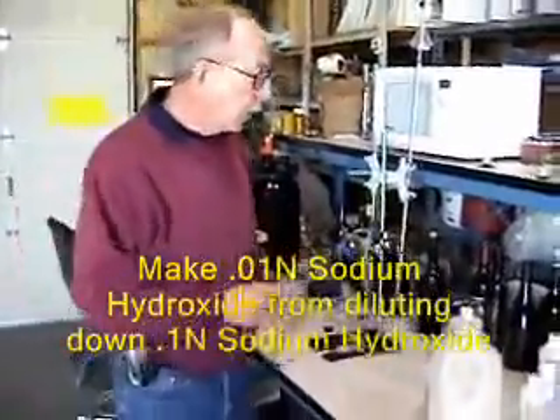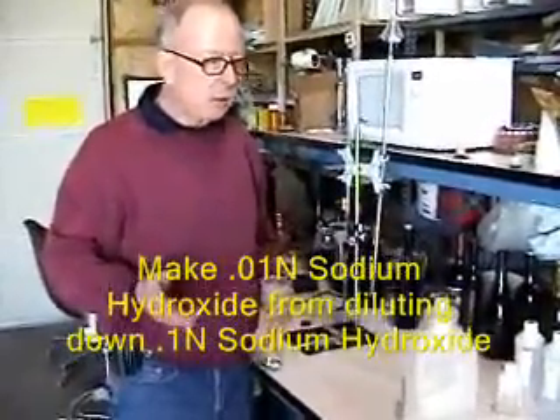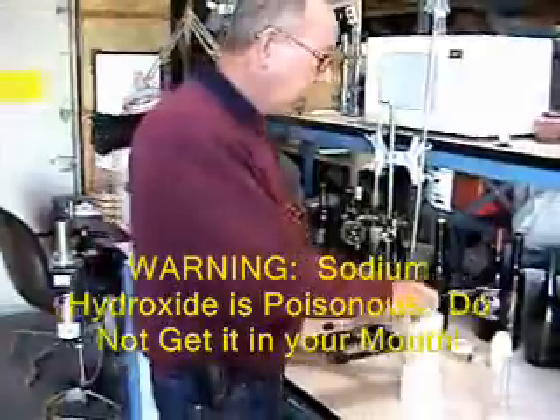One word of caution with the sodium hydroxide: I don't think it will do irreparable damage to you if you get some on your skin — that's easy to wash off. Be very careful, though, that you don't get any in your mouth.